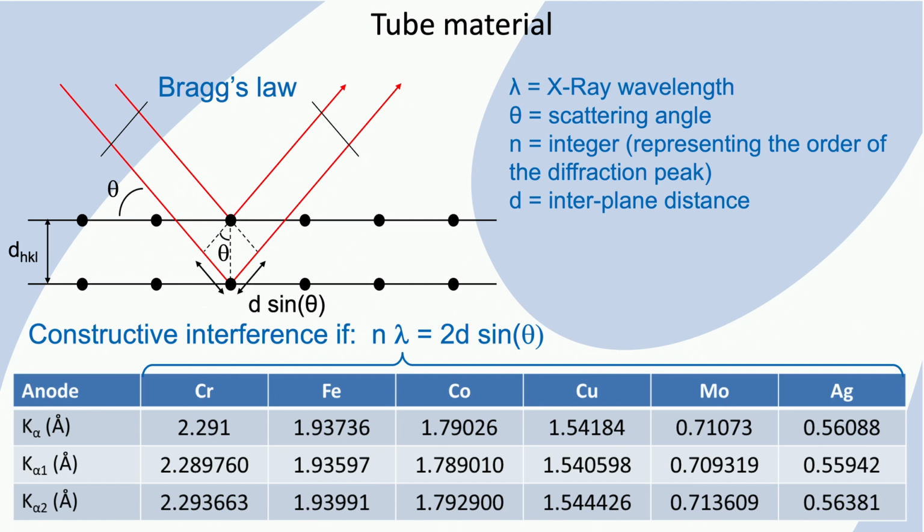The wavelength of these X-rays is specific for the metal used, but it needs to have a relatively high melting point to avoid melting or sublimation under electron bombardment. Most metals give X-rays coming from emissions from the so-called K or L levels.